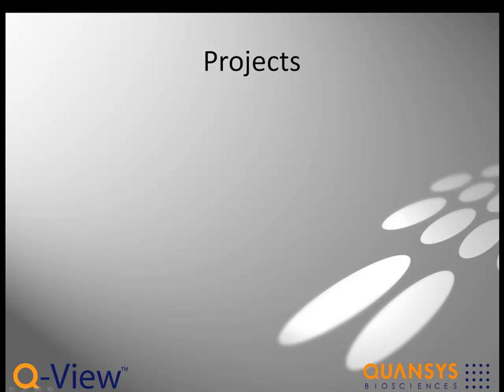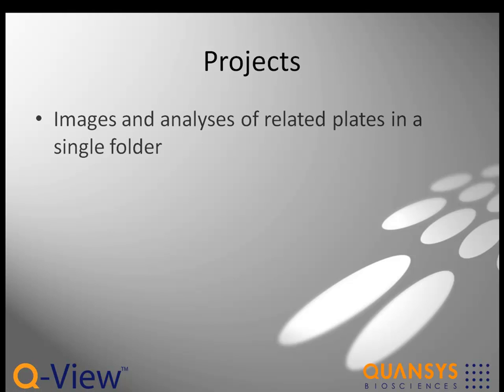QView stores the images and analyses of related plates together in a single folder called a project with the .QView extension.